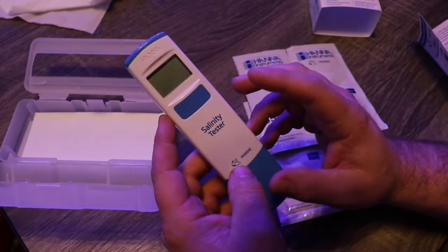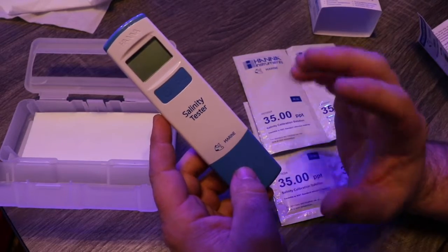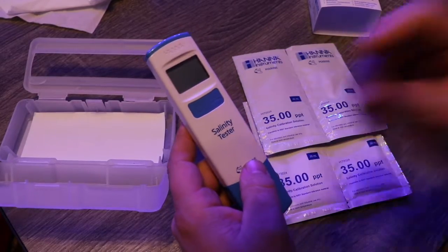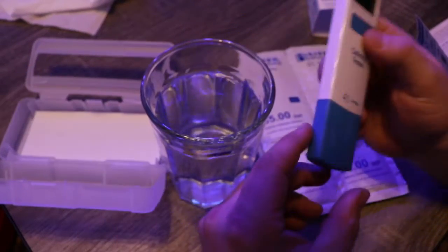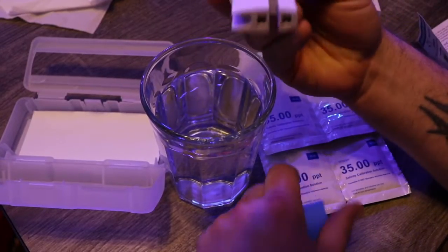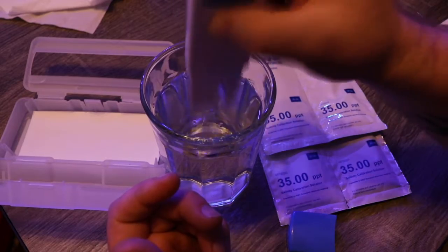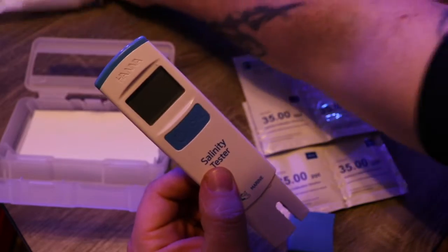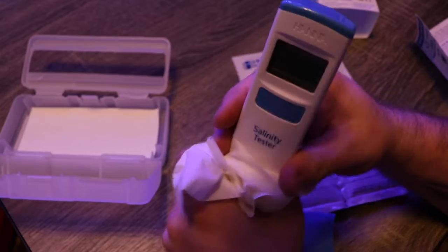Before you turn on your Salinity Tester for the first time, it's important to rinse the electrodes — that's per the instructions of the manual. We have a glass of RODI water here, and we're going to take the electrodes and run them in the water. We'll consider that rinsed, then use a soft tissue to dry them.